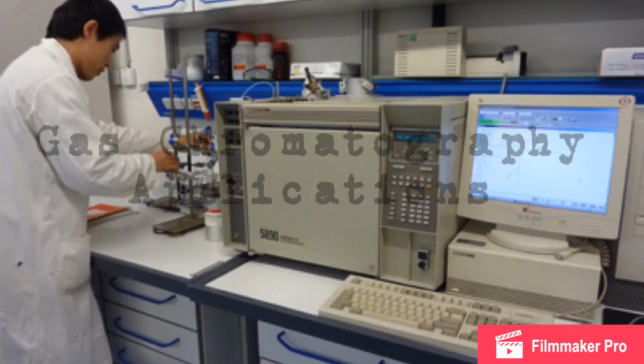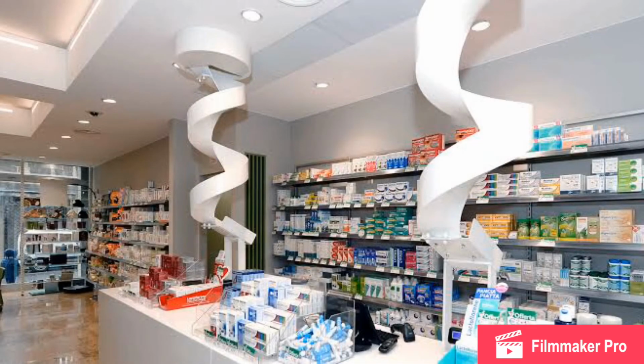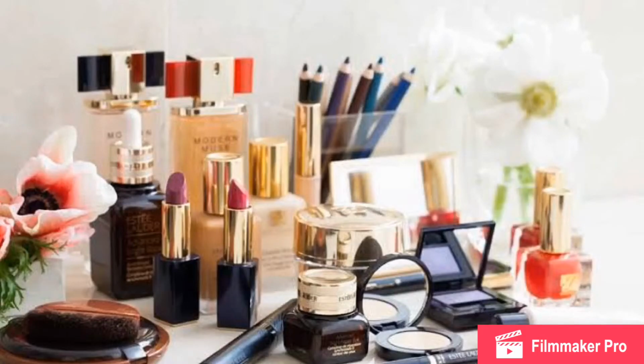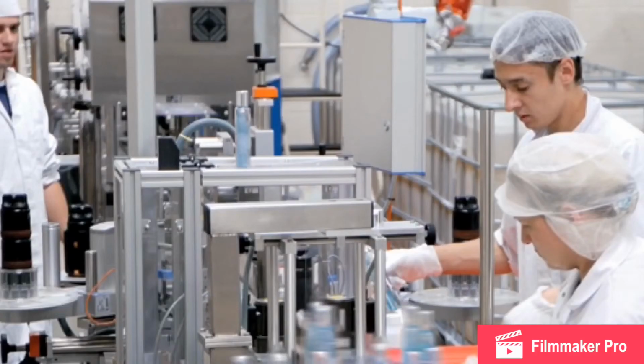Here are some applications for gas chromatography. It can be used in many different fields such as pharmaceuticals, cosmetics, and even environmental toxins. Since the samples have to be volatile, human breath, blood, saliva, and other secretions containing large amounts of organic volatiles can be easily analyzed using gas chromatography. Knowing the amount of each compound in a given sample gives us a huge advantage in studying the effects on human health and on the environment as well.